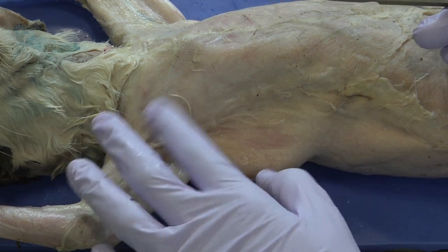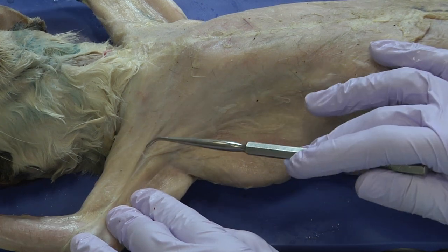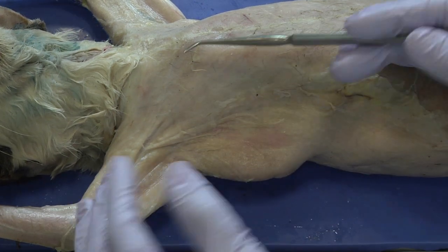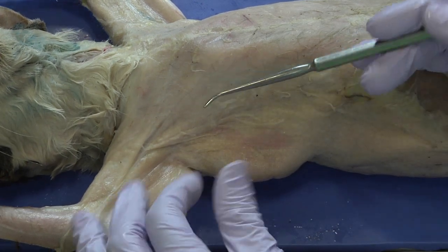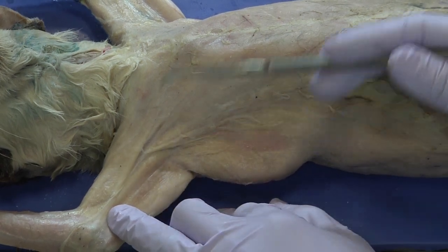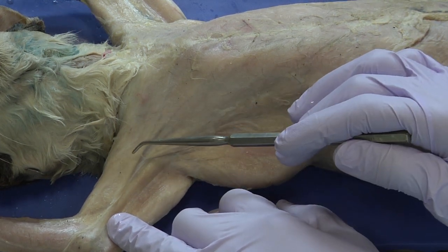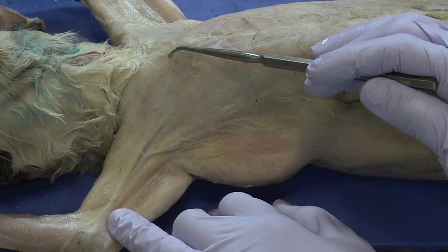The next step is to delineate, or isolate, the muscles from one group to the next. In order to do this, you really have to pay attention to the orientation of the fibers.